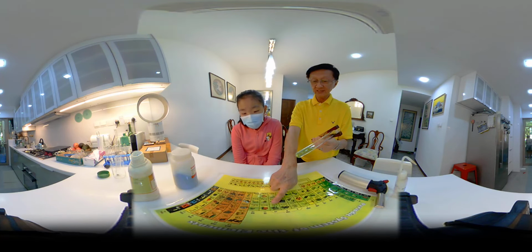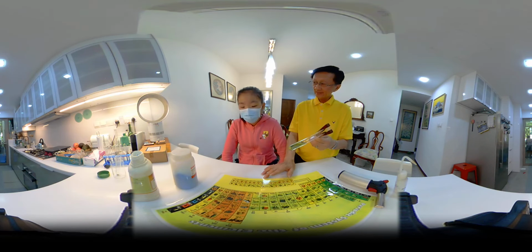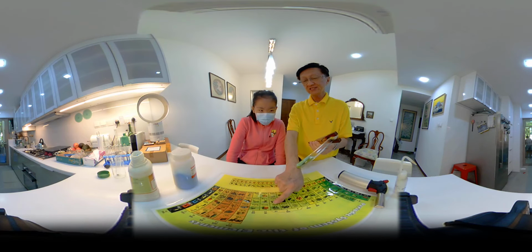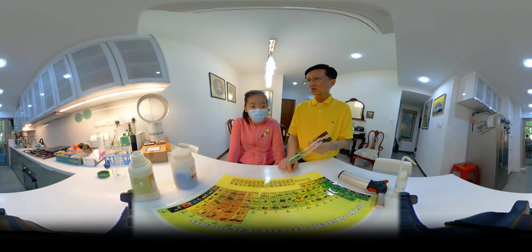If it is blue copper 2 sulfate, then it's due to copper 2 plus ions. How do I remove these ions? I can add something and then it can precipitate out the nickel. And when all the nickel is precipitated out, you find that there will be no more nickel ion floating around and the color will disappear.